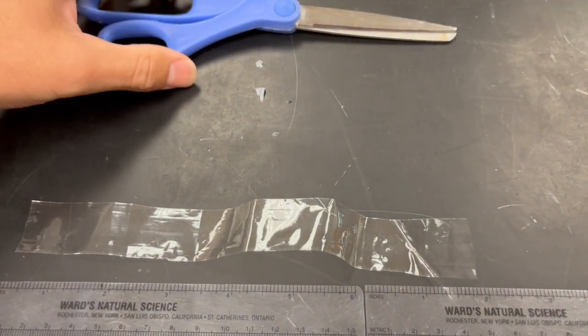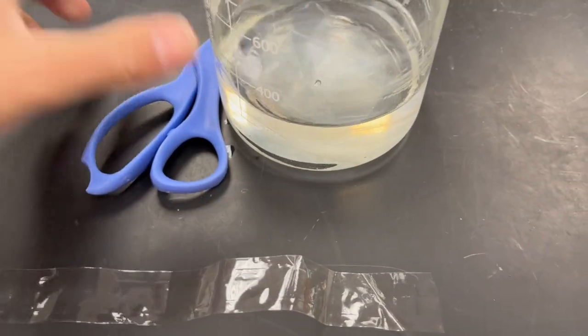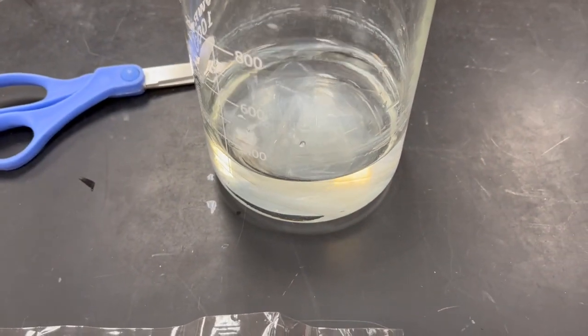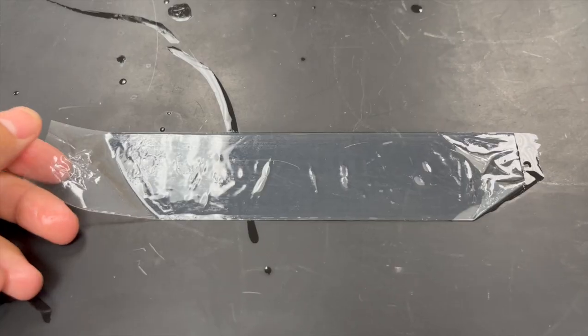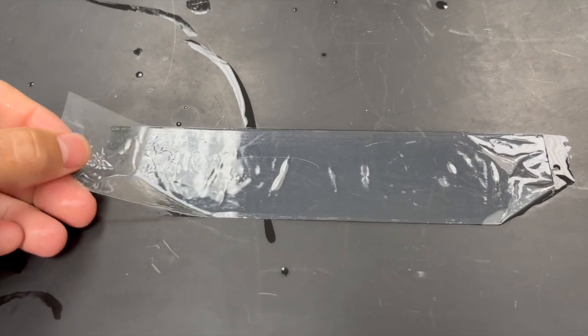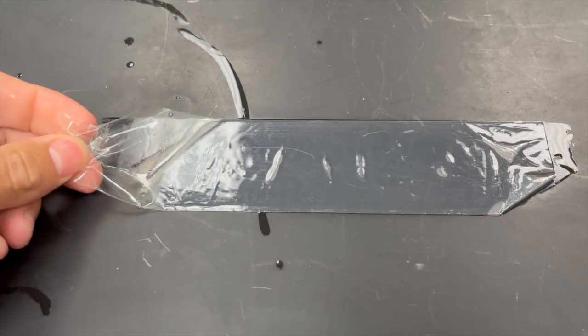After you do the 8 inch strips, you're going to place them in water. Let them soak for 1 to 3 minutes. Once you wet your dialysis tube, you're going to use your thumb and index finger to pry it to get it open on each side.